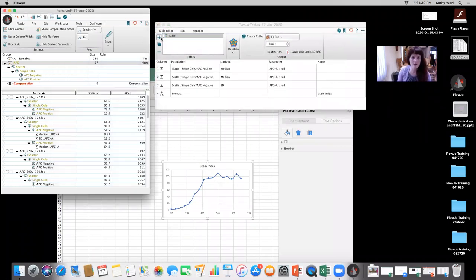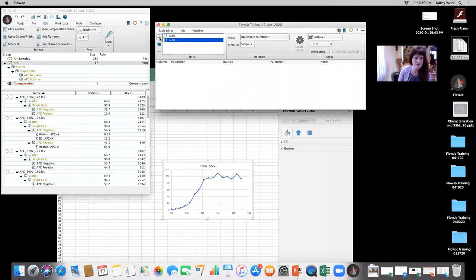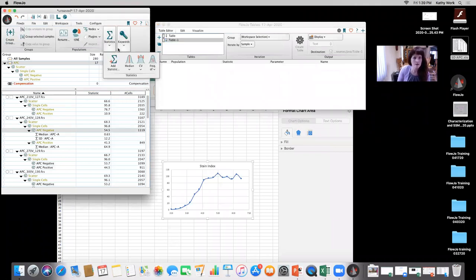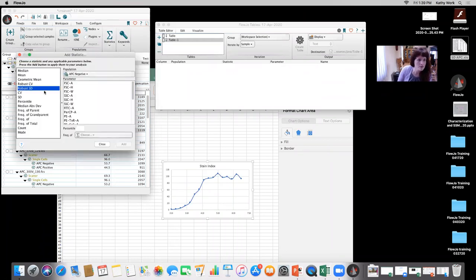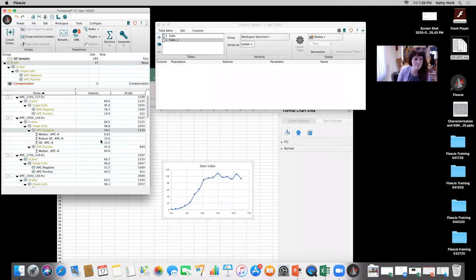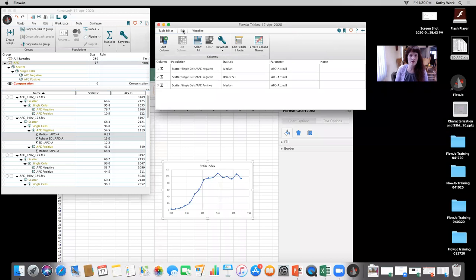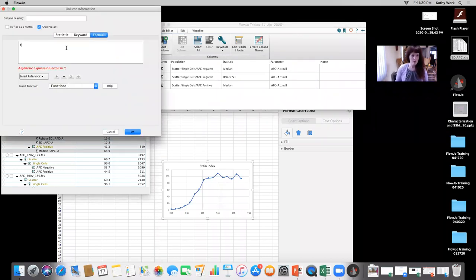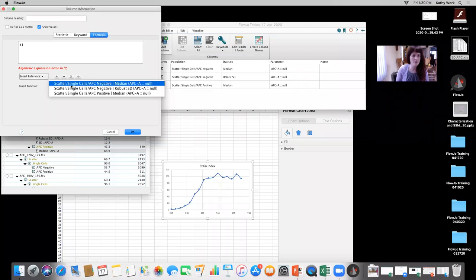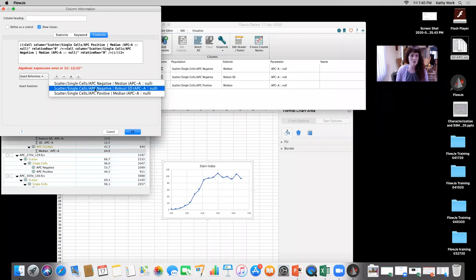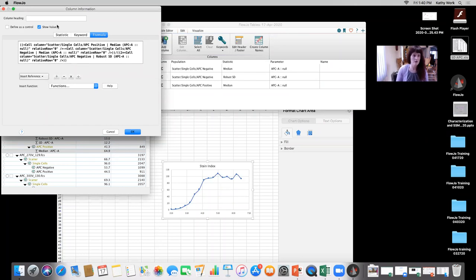Everyone's interested in seeing the RSD comparison. I'll add another table, go back to Workspace, Statistics, Add, and set up a stain index formula using robust standard deviation: (MFI positive minus MFI negative) divided by (2 times the robust standard deviation). I'll call this 'robust' and create that display. I can also copy it to clipboard or export it to a file. Let me export it to a file on the desktop.